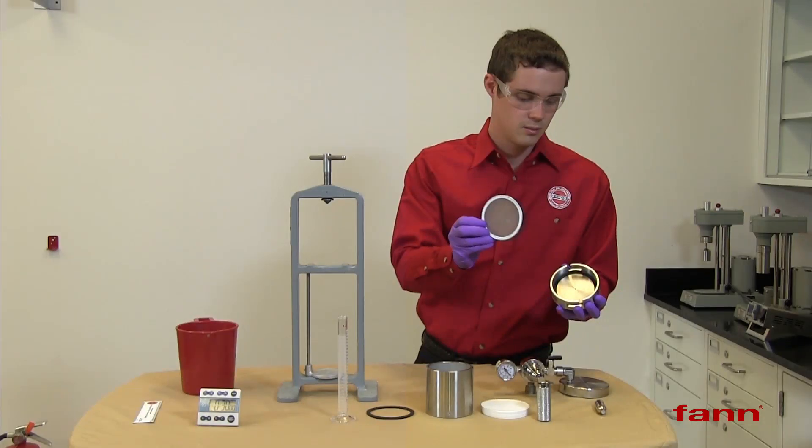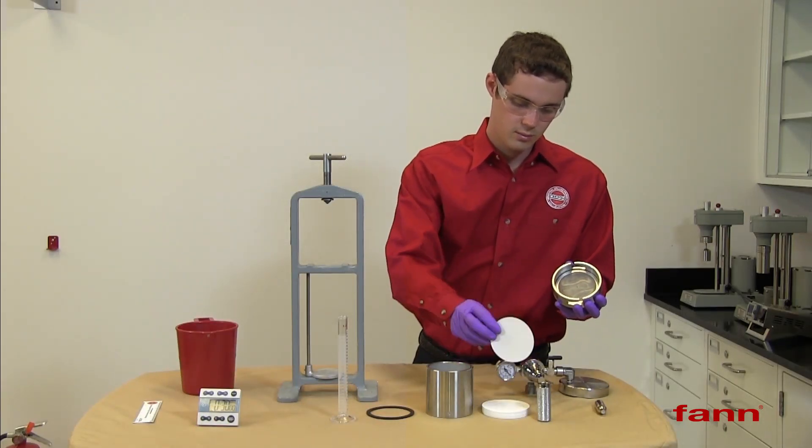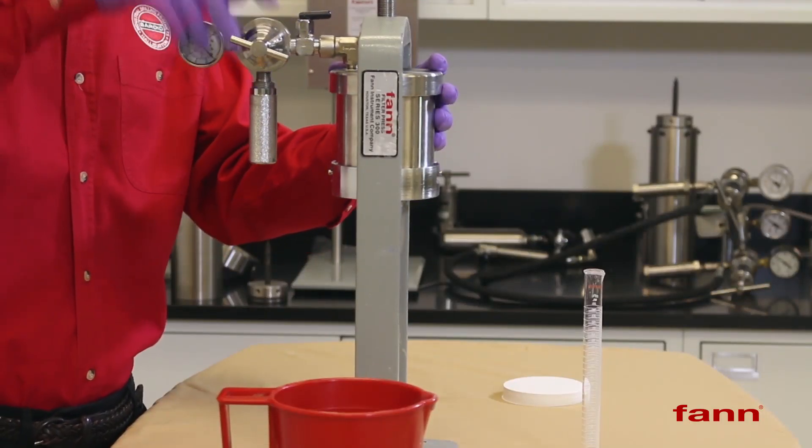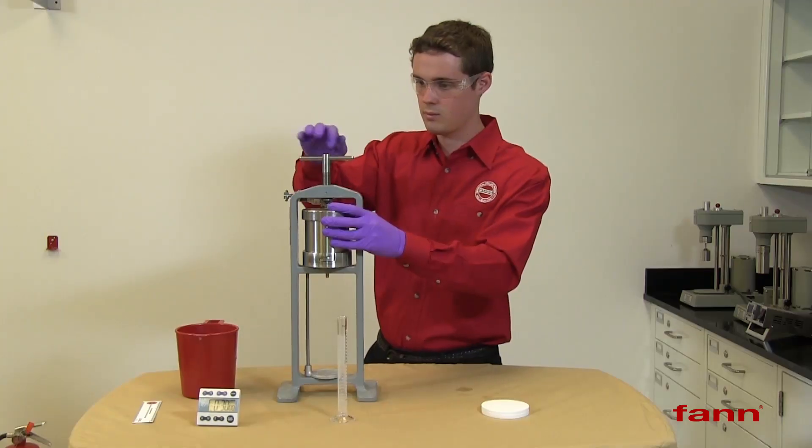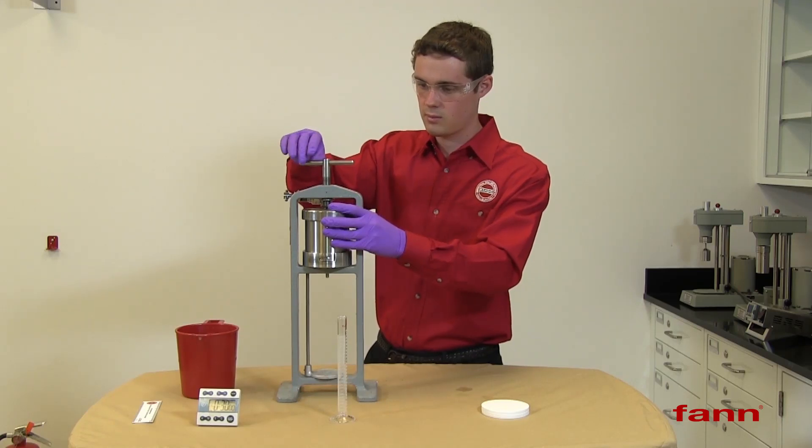We have the top air assembly. We need to add a gasket to this also. Attach this assembly to the top of the barrel. We'll be putting this cylinder under 100 pounds of pressure, so be sure the set screw is tightened securely.